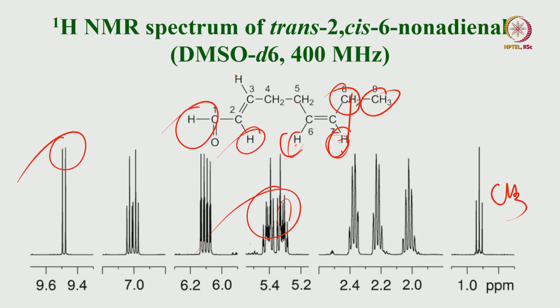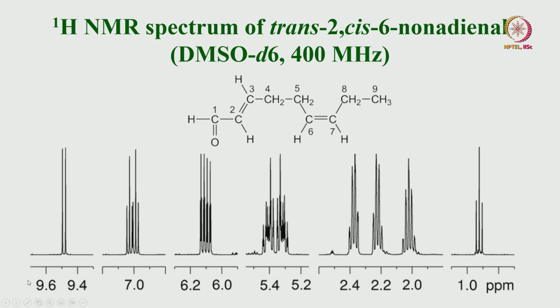How do you understand this thing? It is a fairly difficult thing. We have to resort to a little bit of an advanced technique called 2-dimensional NMR for this, but right now I will make a rough guess of the analysis and we will confirm it later. Based only on the multiplicity pattern, I will start making assignments.